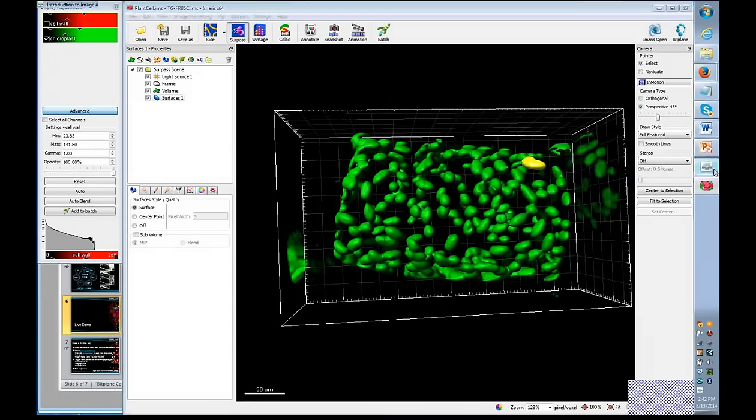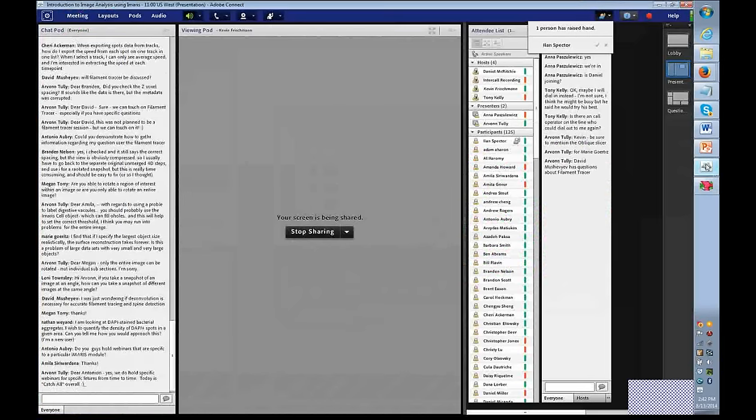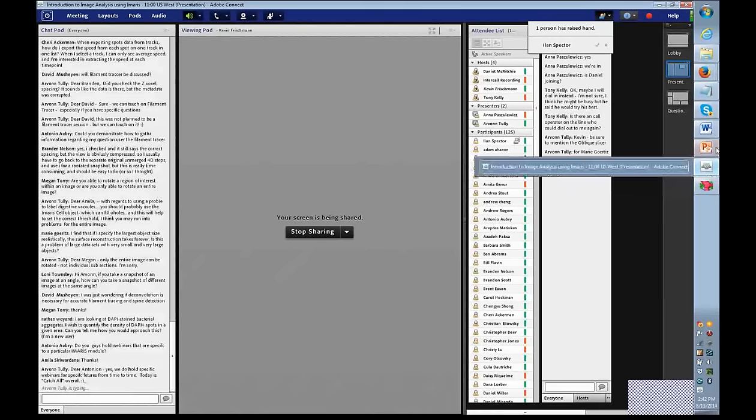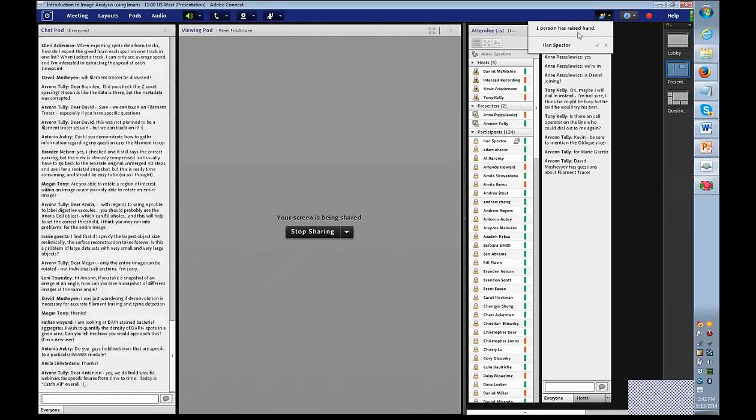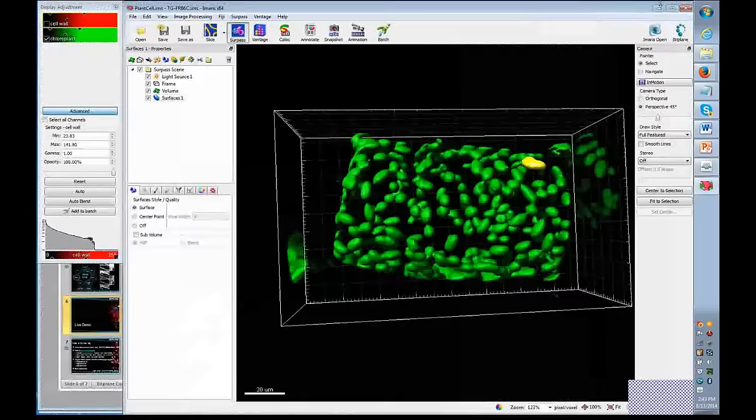I'm going to switch over here and see what we've got. And Arvonn, if you want to just pipe in any questions that you thought would be good to demonstrate as you were answering them, feel free. So it'll probably take me longer to find them. Kevin, I'm putting a couple off to the right-hand side. Gotcha. That I think would be good to talk about.